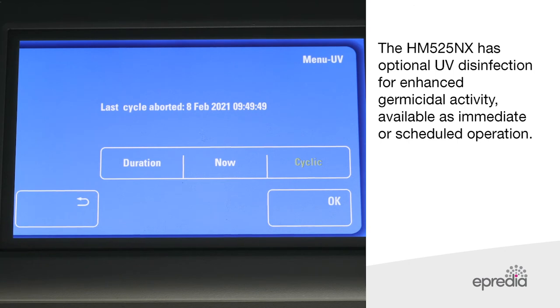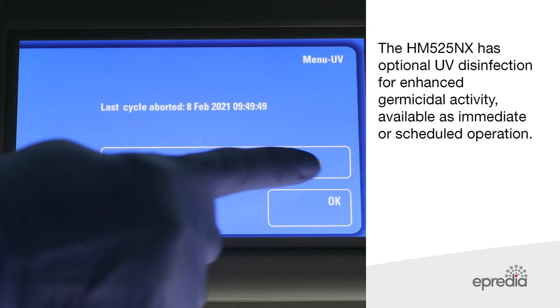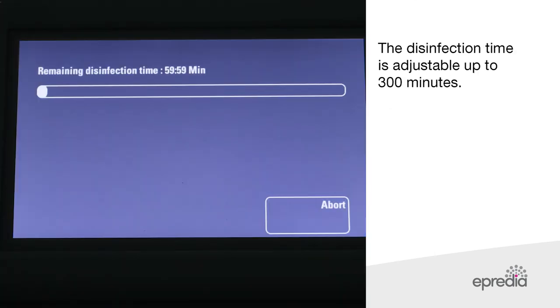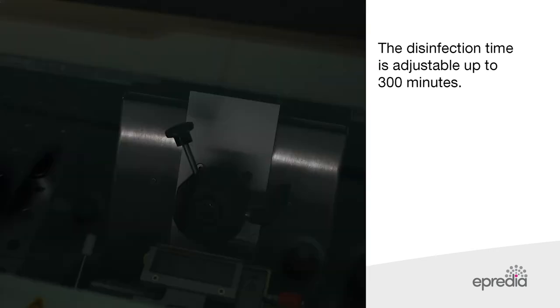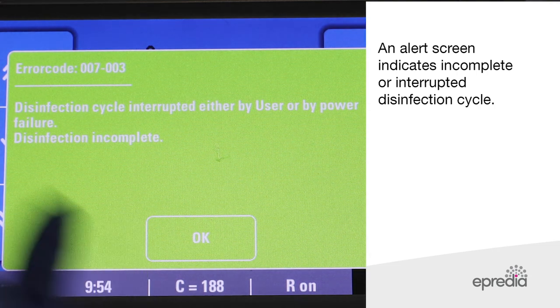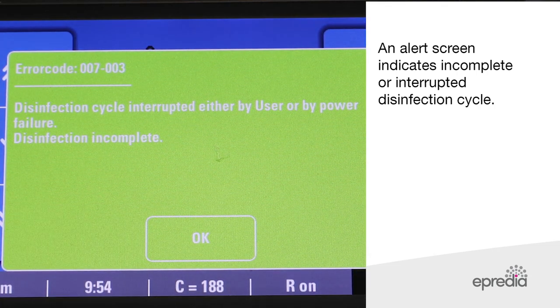The HM525NX has optional UV disinfection for enhanced germicidal activity, available as immediate or scheduled operation. The disinfection time is adjustable up to 300 minutes. An alert screen indicates an incomplete or interrupted disinfection cycle.